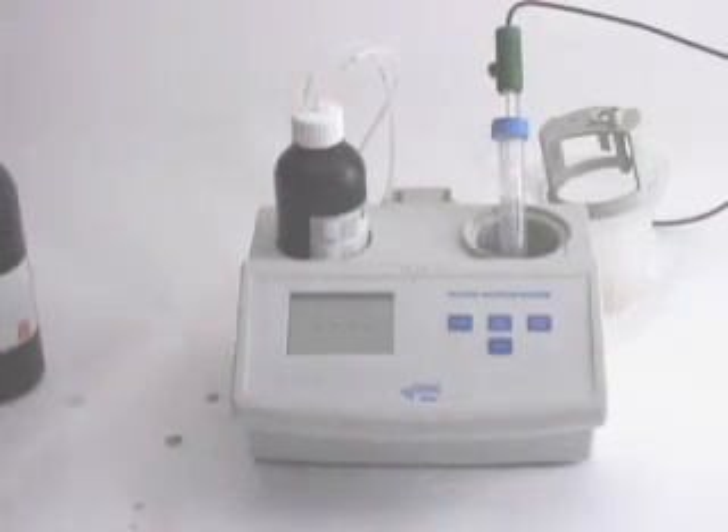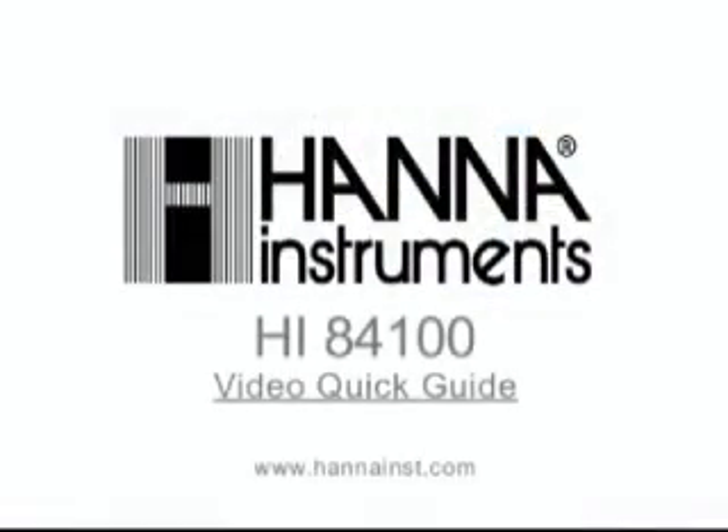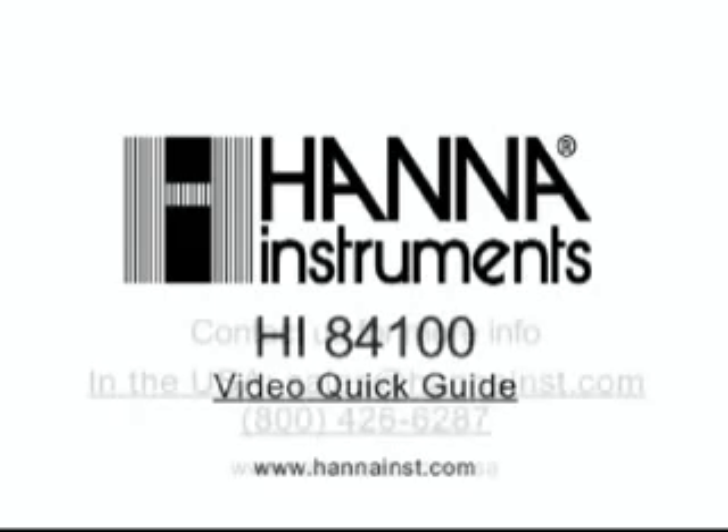And that's the HI84100 free and total SO2 meter by Hanna Instruments. If you have any questions or would like to purchase this product, please give us a call.